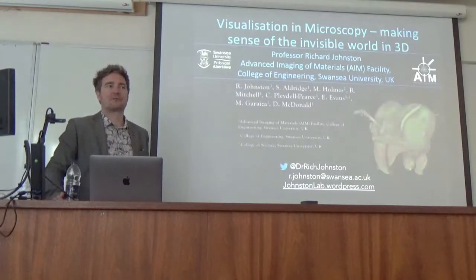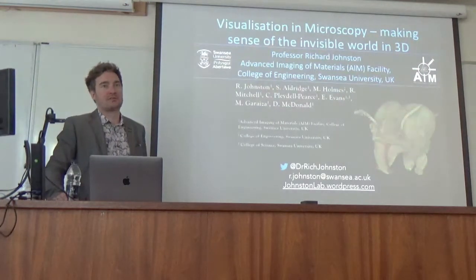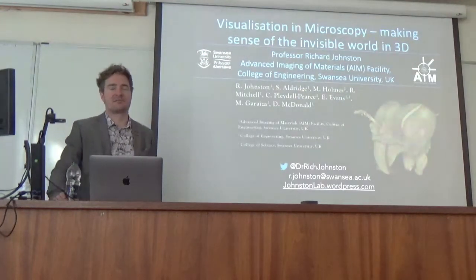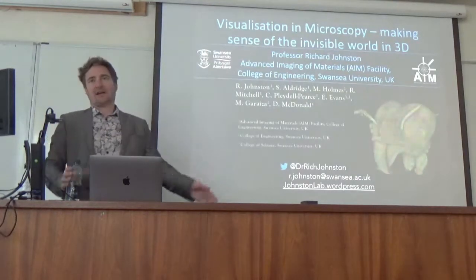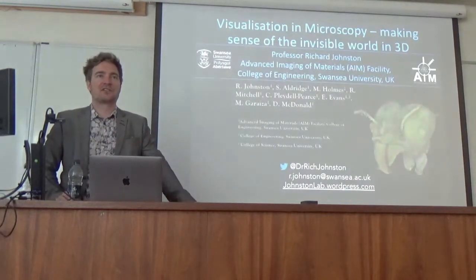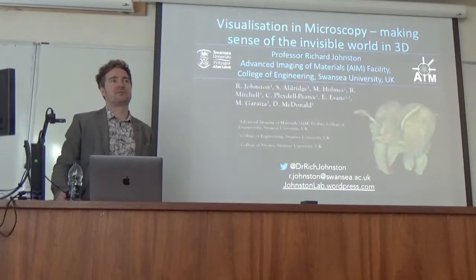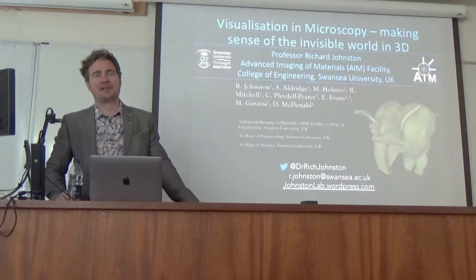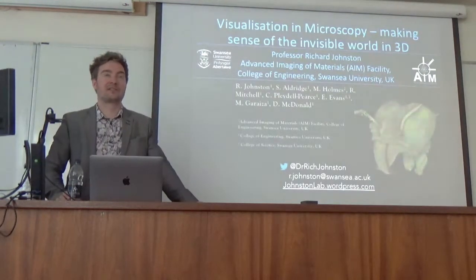Yeah, it's always a challenge. We collaborate with tons of people, and a lot of them end up coming back into our lab to use the computers and the software. Which is fine, because to be honest that's the best method, since they're the expert. If you're segmenting out parts of fish anatomy, they know best what is likely to be inside. They've just never seen it like that before. So particularly with the more challenging ones, even with the machine learning, we usually work in partnership with the person. And if we produce an academic paper, that's not the best thing to reach different audiences.